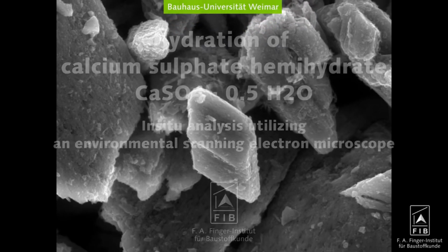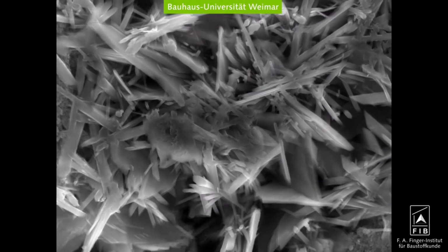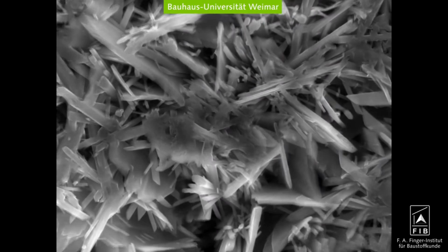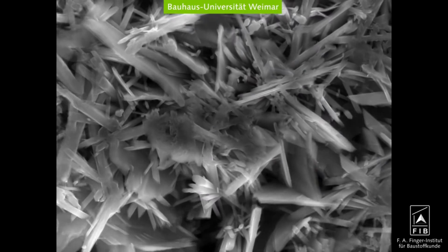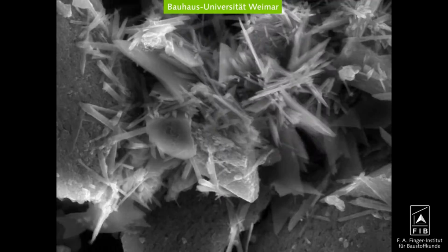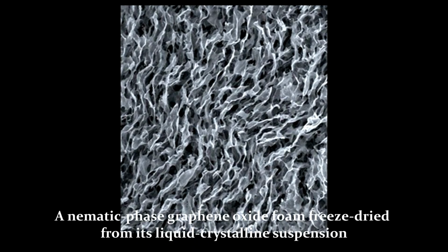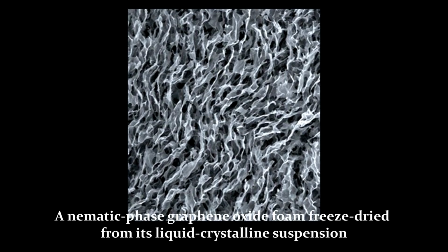However, it was amazing how many people used SEM and TEM, transmission electron microscopy, for engineering purposes. We can see amazing features of elements of the crystals on the surface. For example, if you have some kind of new material you're creating for, I don't know, building construction or engineering or for microchips, you will use your SEM to see how it behaves, how it corrodes, which material is strong or not, discovery of graphite or something like that.